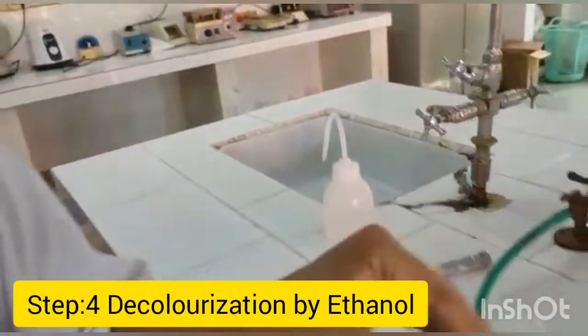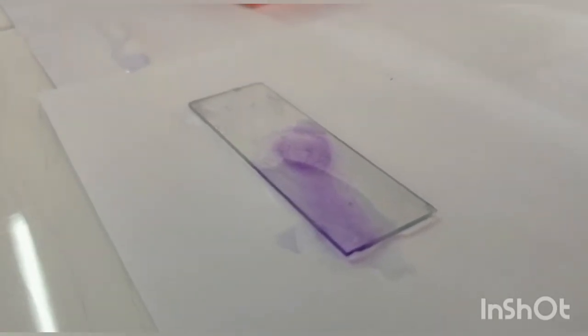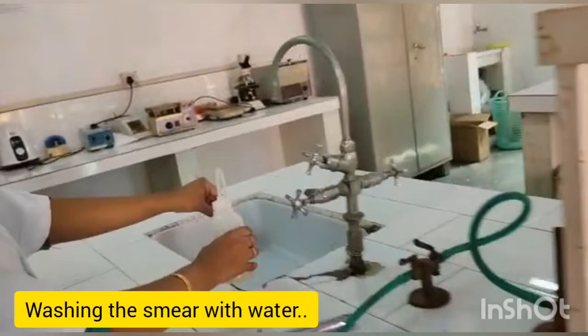Wash it with ethyl alcohol. Once it is washed off, wash it with clear water again. The next step is the application of the counter stain, that is the safranin.